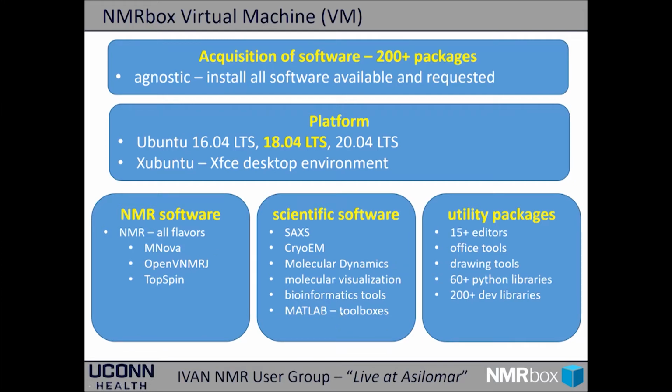One other note is that the University of Connecticut's site license to MATLAB is now accessible to all NMRbox users who are running on our platform. They cannot download it and run it locally, but if you're running on our servers, you actually have access to all of MATLAB. And I believe we have all of the MATLAB toolboxes as well.